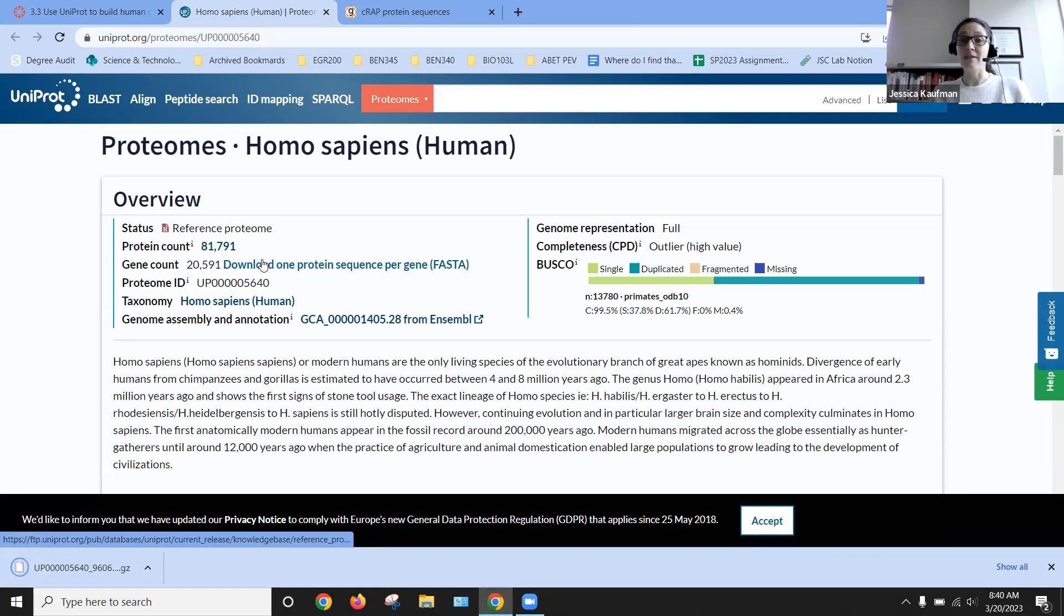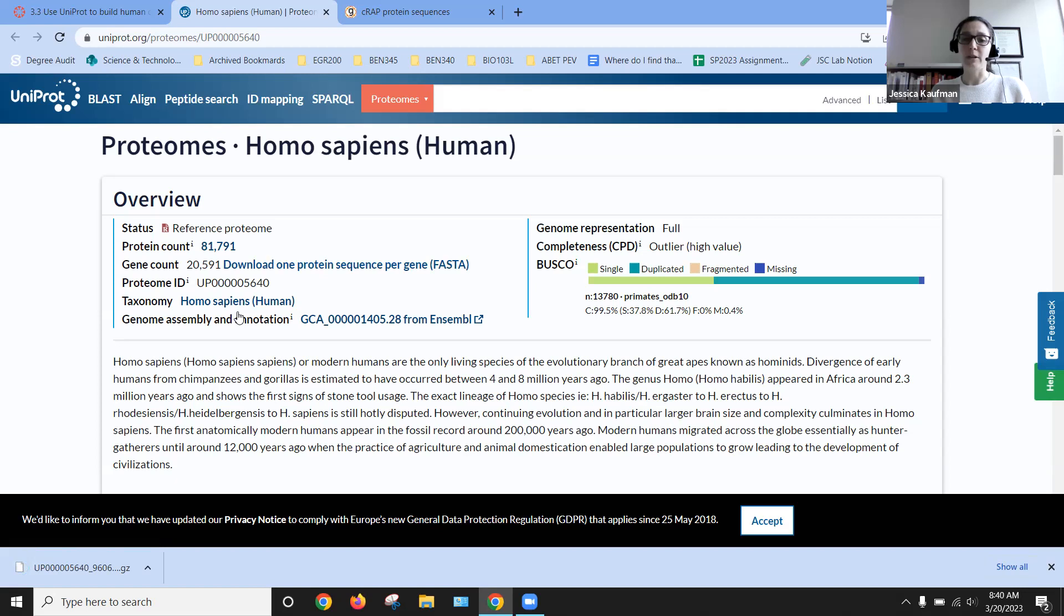We can click on it and download the file. It will come down as a zipped file, so we'll need to unzip it to be able to use it on the computer.